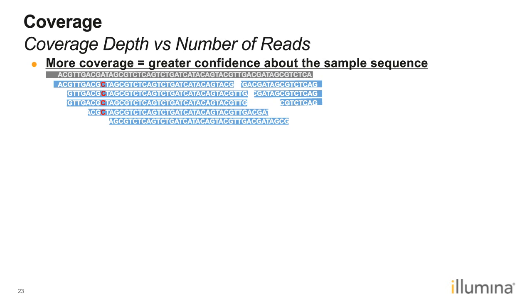And you'll notice that in the DNA sequencing world, we talk about coverage in terms of how many X. Is it 30X or 100X? For RNA sequencing, we are using the absolute number of reads. And part of this is because RNA is dynamic. So there will be varying amounts of the transcriptome in various cells. So it's hard to say a coverage for something that is varying, which is why we use the number of reads itself.